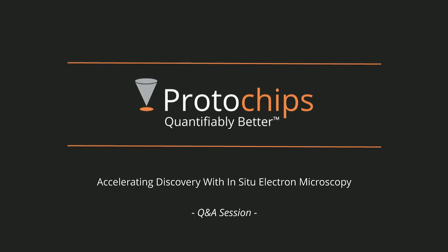The other thing that I do want to mention is, when you do the transfer process, and to be able to see at atomic resolution, the fusion heating chip microchip devices can have either a silicon nitride membrane or a carbon membrane as a support material. We like to use the silicon nitride membranes that we modify with the focused ion beam instrument to create an array of tiny holes through which we can see at atomic resolution. So you're putting your 2D material on the chip that's supported by silicon nitride, but still has holes in it so you can see at atomic resolution.